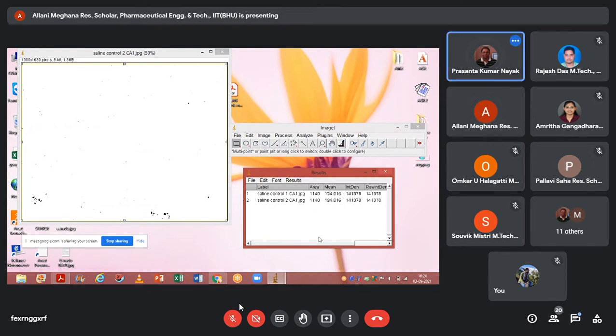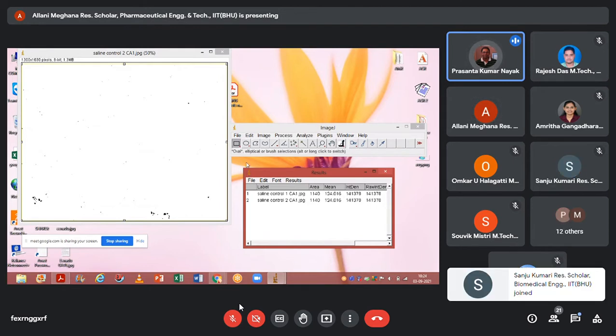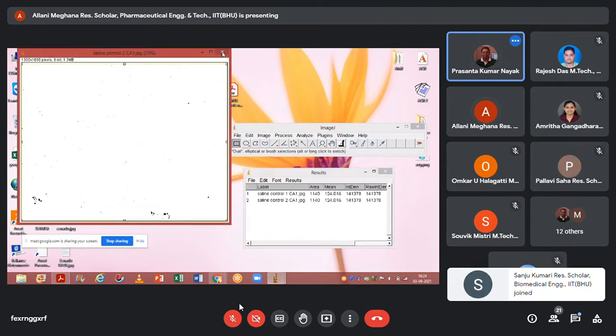Good job. Can you do another one from another group so we can see the threshold changes? Okay, sir.